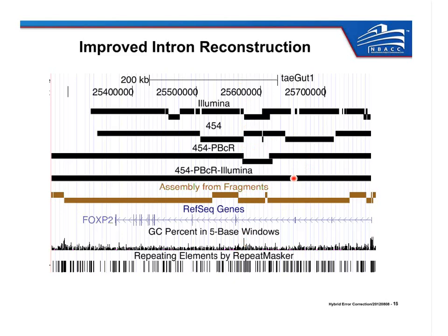So for the first time, even compared to Sanger data, we have the full intron structure of this gene that we haven't had before. So this makes studying these genes much easier because you can actually see the regulatory sequence, intronic sequence that you couldn't get any other way. By any of the other assemblies, we're just missing this information.